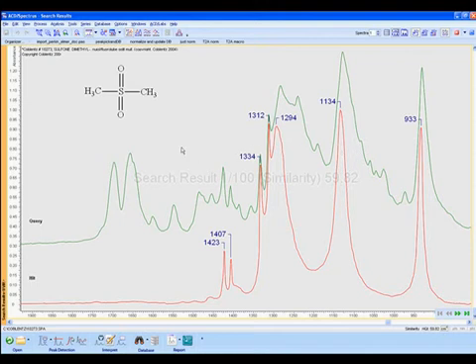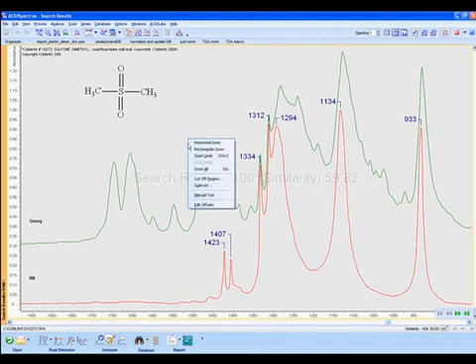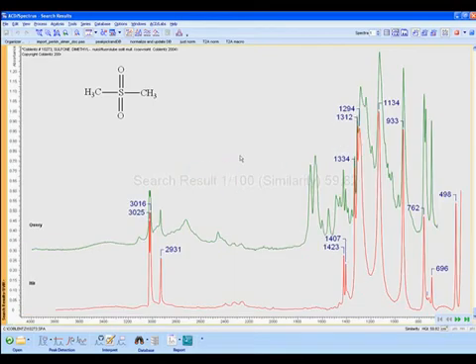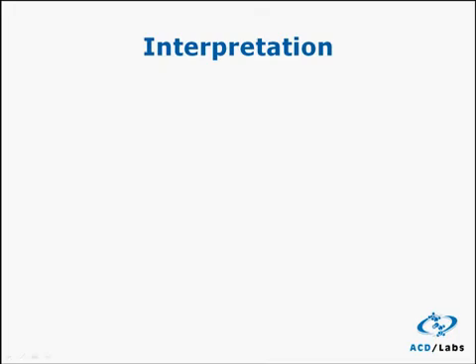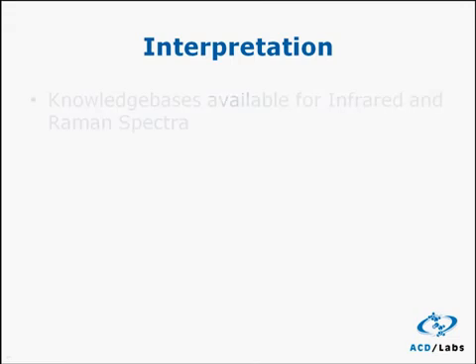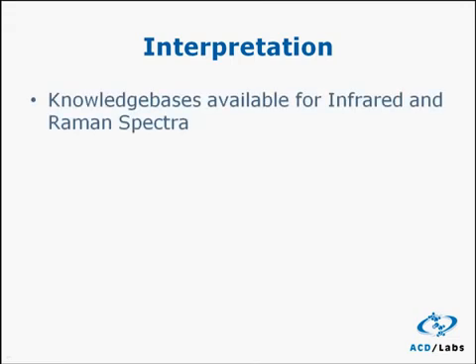To return to a full view, right-click and select Zoom All. We'll now take a look at some of the tools that help us to interpret spectra. We have knowledge bases of infrared and Raman spectra.